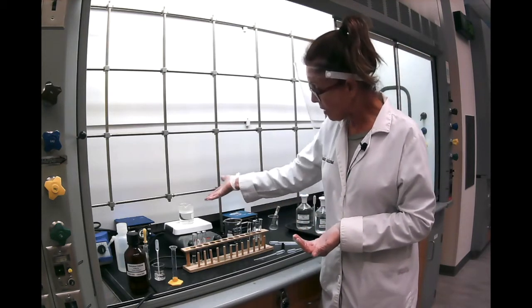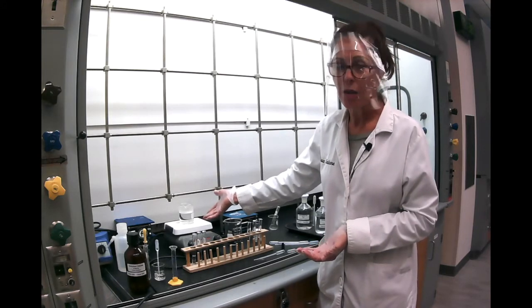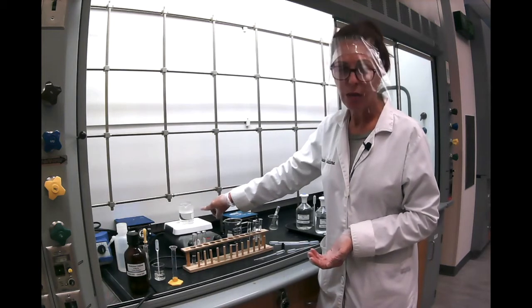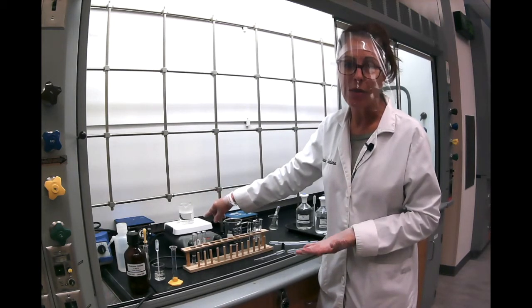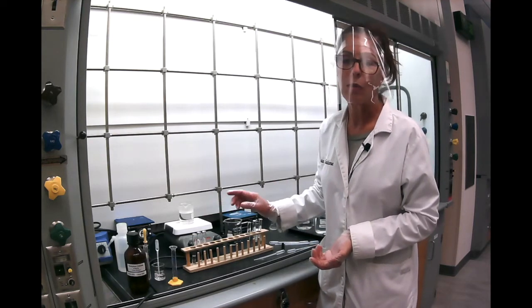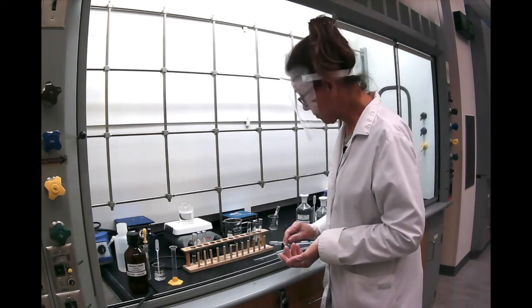So that's the reason we have here a water bath that is being heated. When you prepare a water bath, you have a beaker, put some water in it. Tap water is okay because all we need is just to heat the water. And don't forget to put boiling chips. So we have 2 boiling chips in there.